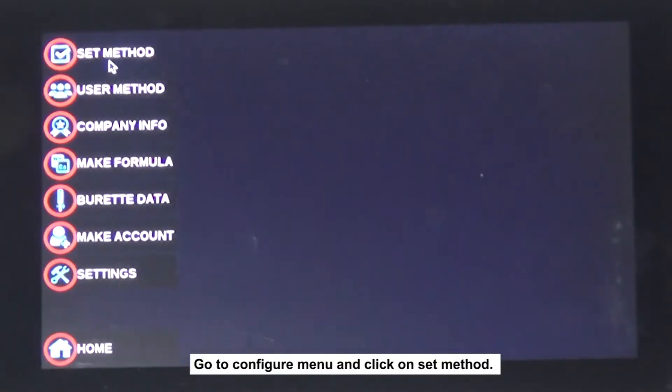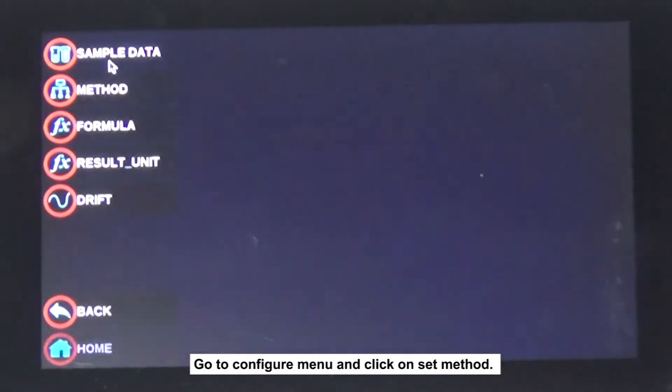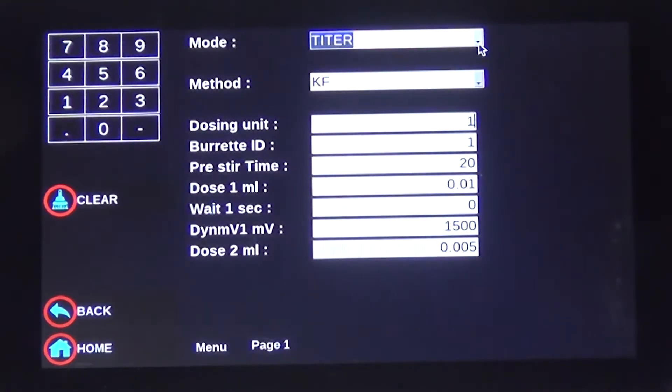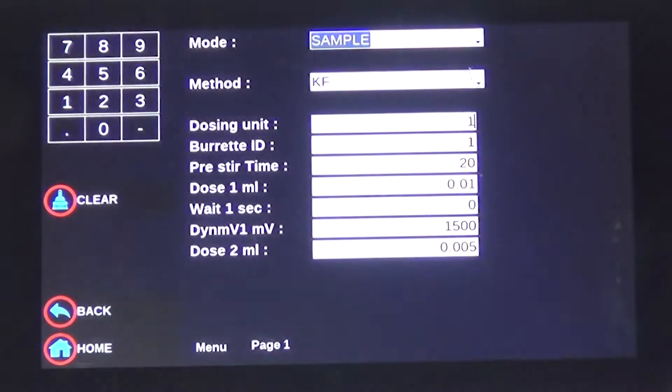To create a method for sample moisture determination, go to the Configure menu and click on Set Method. In the Sample Data screen, the mode is changed to Sample.